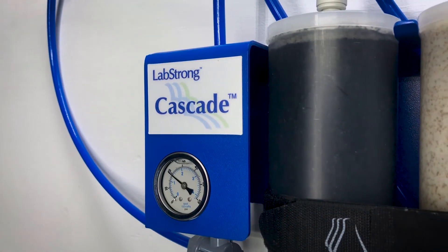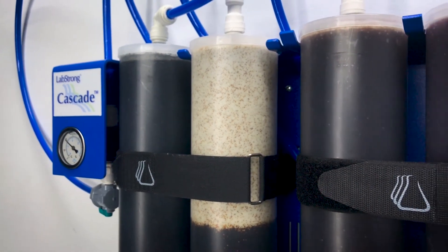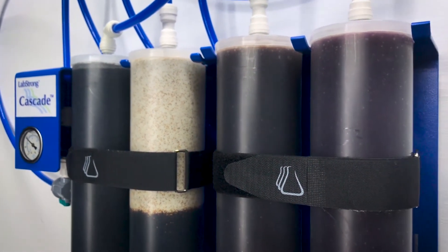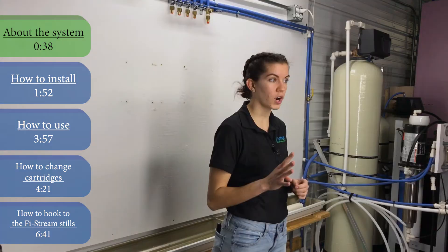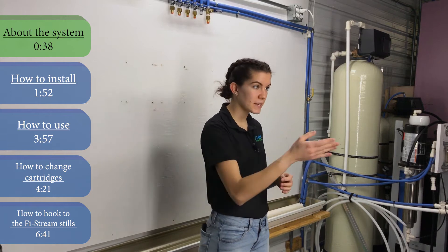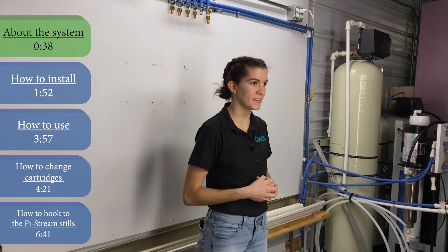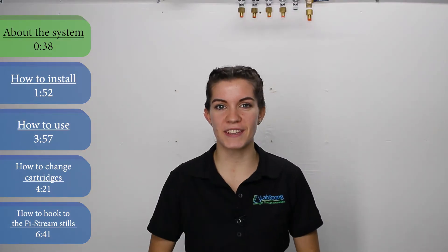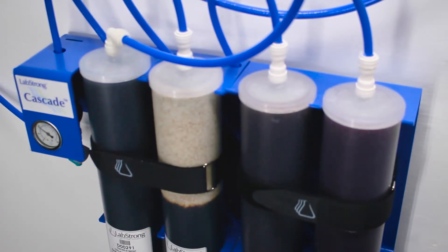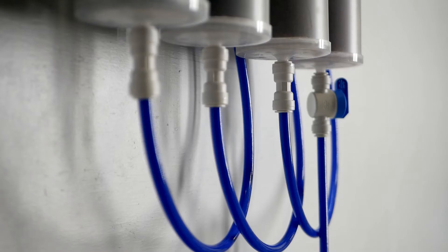The Cascade comes in two variants: the dual system and the quad system. The only difference between the two is the number of cartridges the system can utilize. The dual system has two cartridges, whereas the quad system has four. You might choose one over the other based on how much water you need, as the quad system has a greater Type 2 water capacity. What's convenient is the interchangeable cartridges allow you to perform maintenance all on your own. What we have here today is the quad system. The dual system looks just like it, but without the additional cartridge mounting bracket and with two less cartridges on the right side.